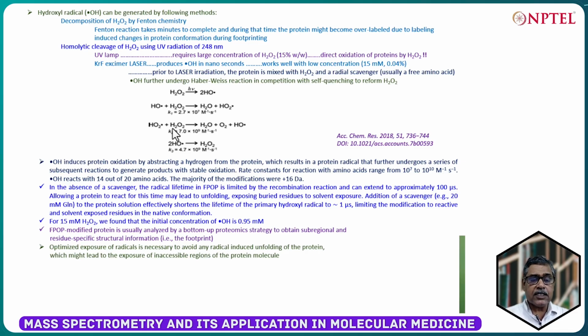Now, optimized exposure of radical is necessary to avoid any radical-induced unfolding of the protein, which might lead to the exposure of inaccessible regions of the protein molecule.